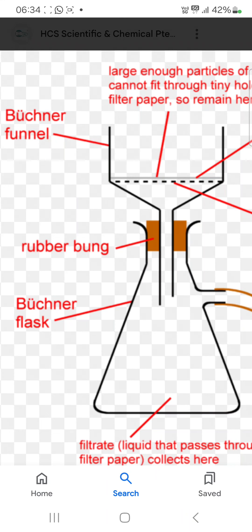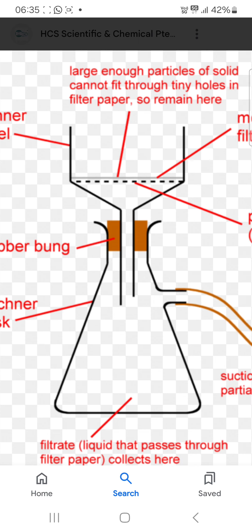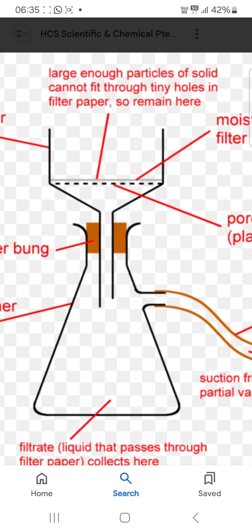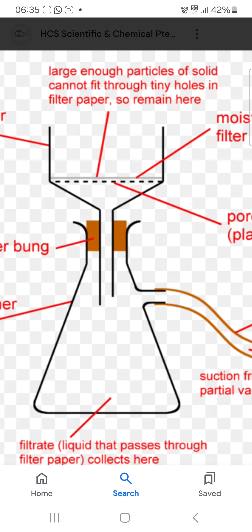Hello friend. Today in this video I am going to talk about filtration. I will introduce one important funnel, and that funnel is known as the Buchner funnel. This shape funnel is known as the Buchner funnel. Large enough particles of solid cannot fit through the tiny holes in filter paper.